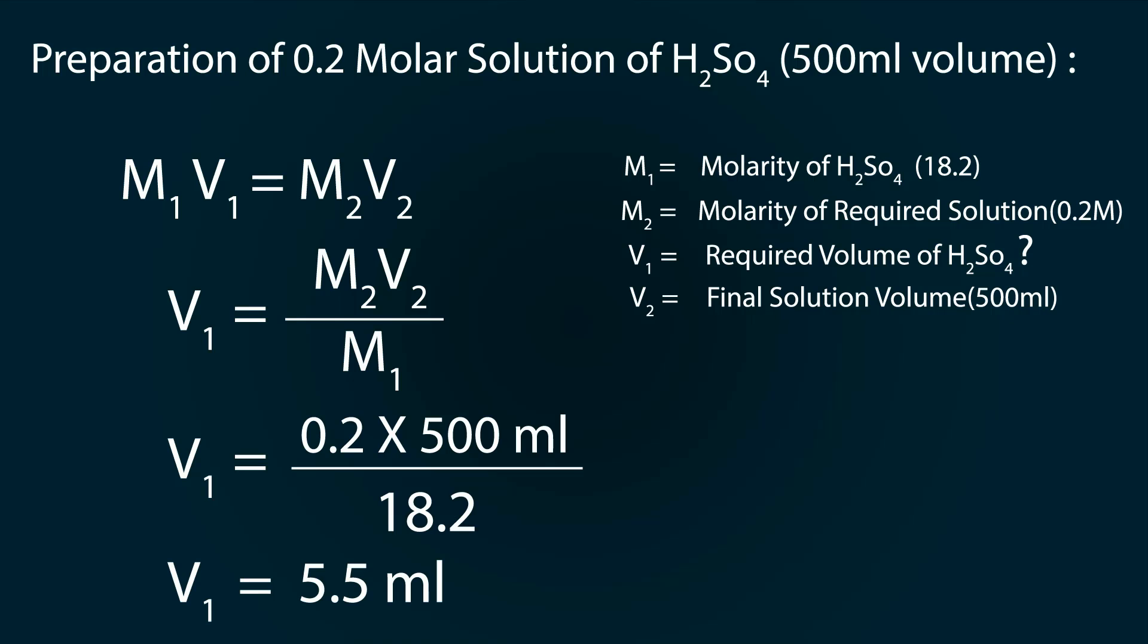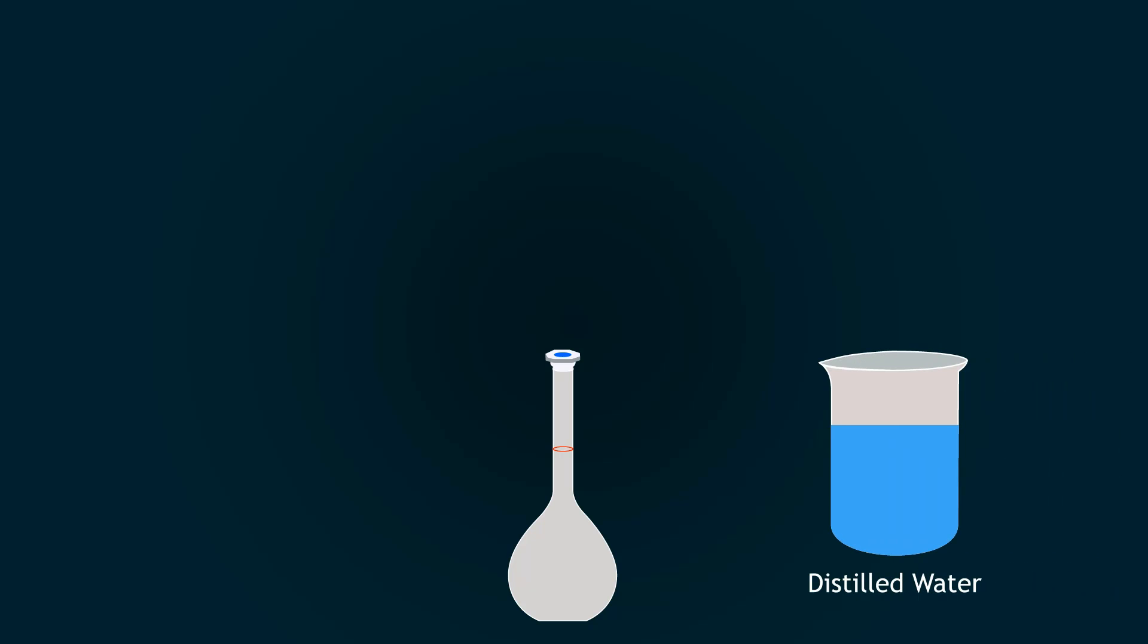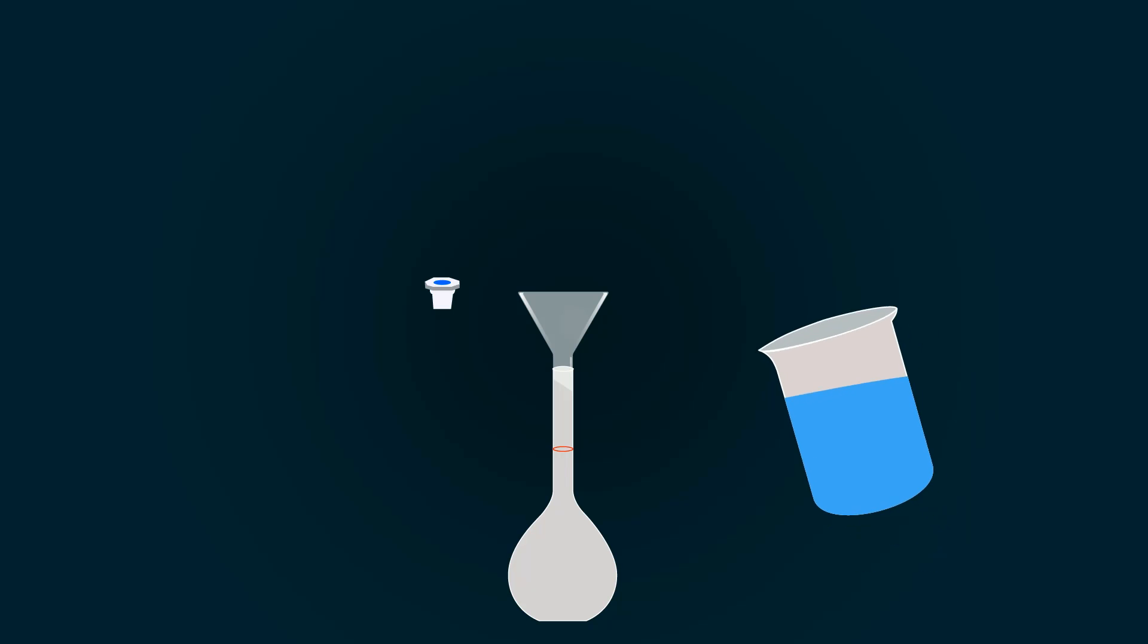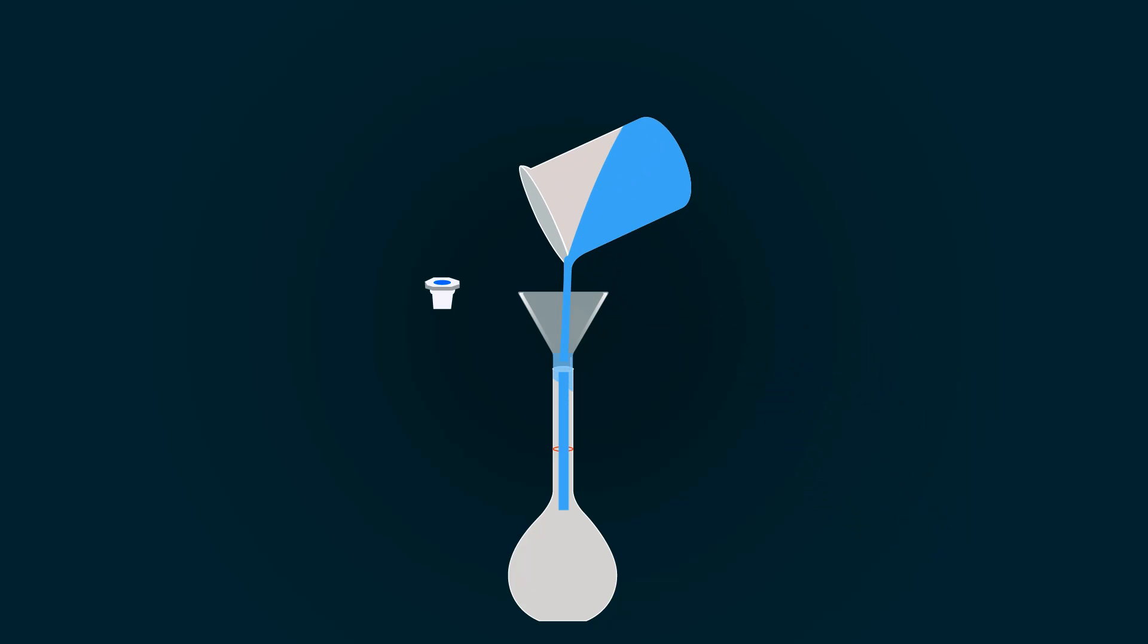Now let's start our preparation. Take a volumetric flask and add some distilled water into it. Please do not add sulfuric acid directly into the measuring flask because it may harm you or the flask.